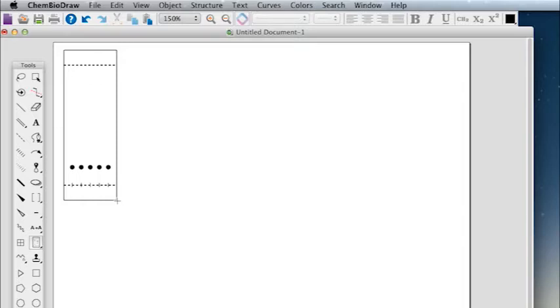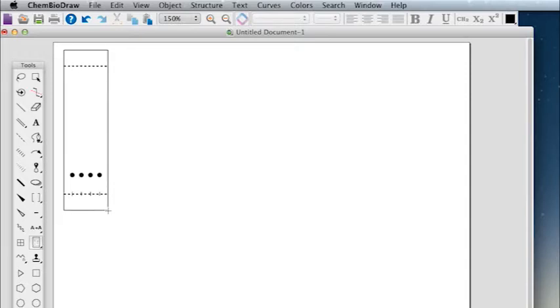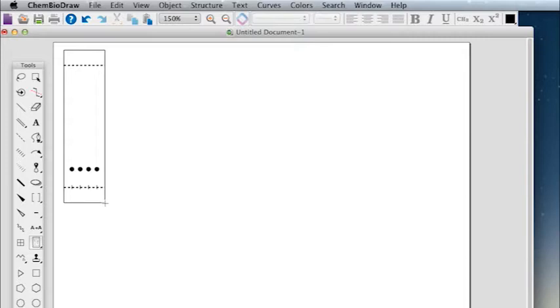As you can see, if you drag it down, it will make the plate longer, which ultimately is not as important because TLC uses retention factor values, known as Rf values. This will be more so for your preference. You can also drag the plate to the right in order to increase the number of lanes. Once you let go, the TLC plate will be set.